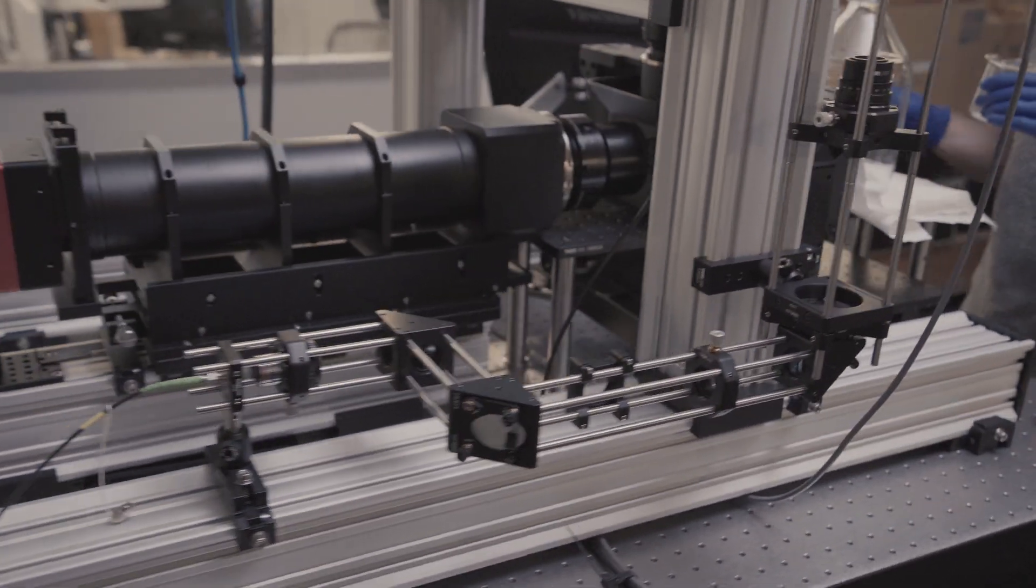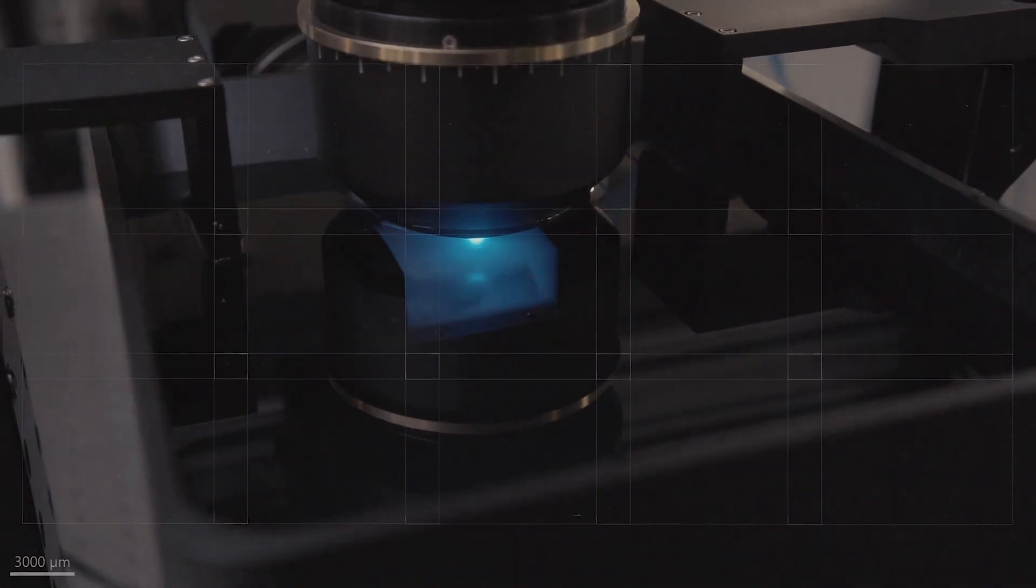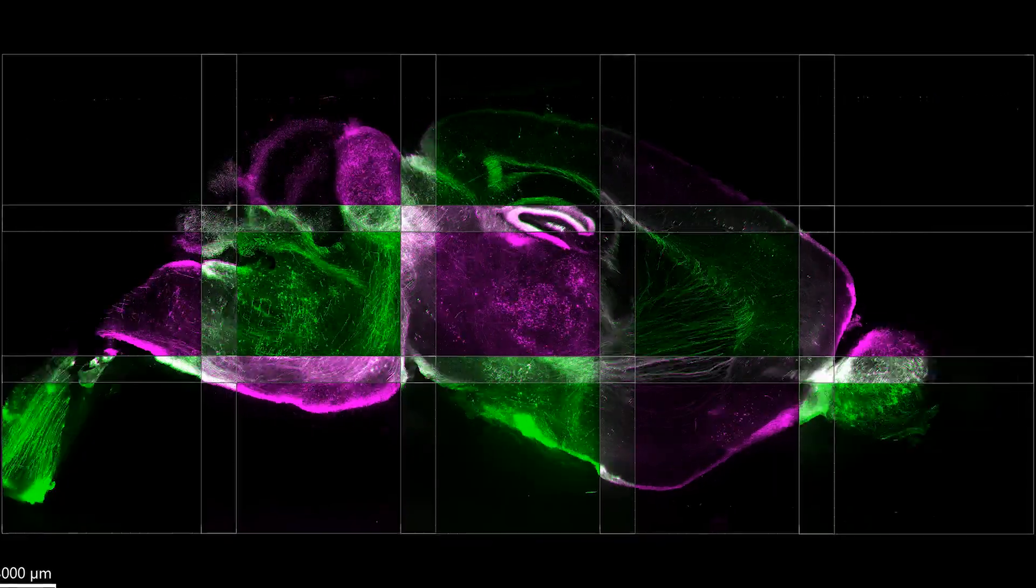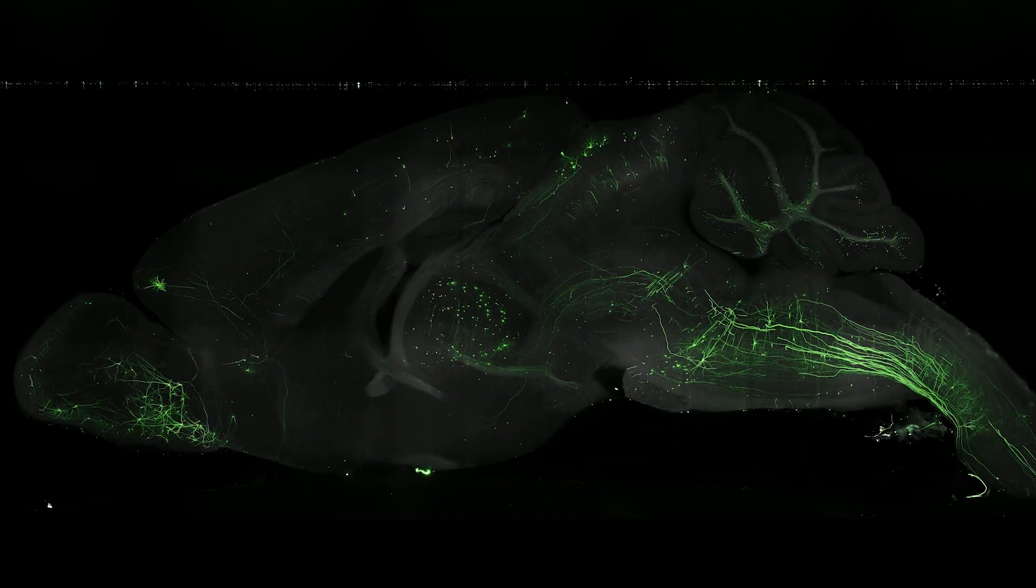This microscope is known as a light sheet microscope and basically we use a laser and a number of lenses to shape that laser light into a thin sheet and it excites dye molecules which then fluoresce at certain places within the brain.